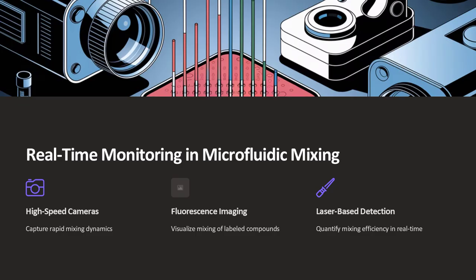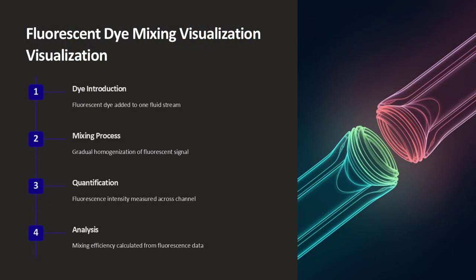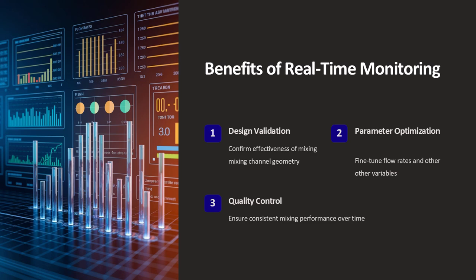To overcome this, microfluidic engineers design channel features such as obstacles, grooves, or curved paths that deliberately disrupt the laminar flow and create chaotic or laminated mixing patterns. Additionally, active mixing techniques can be integrated to provide an extra level of agitation where passive methods might fall short, especially when rapid reactions are required or when dealing with high viscosity fluids.